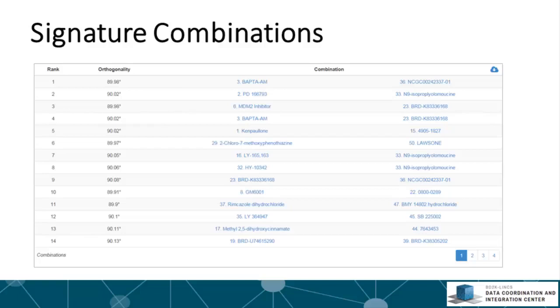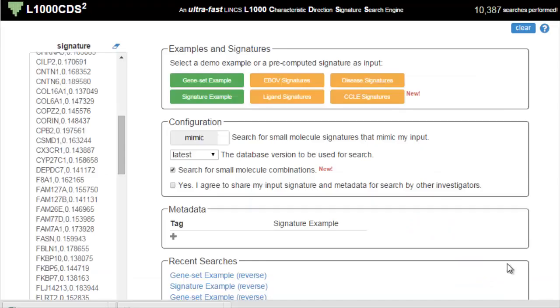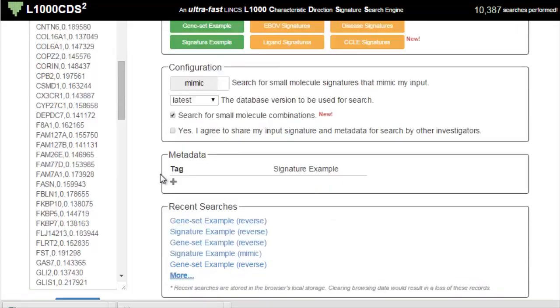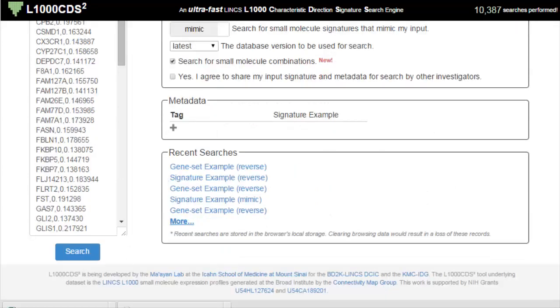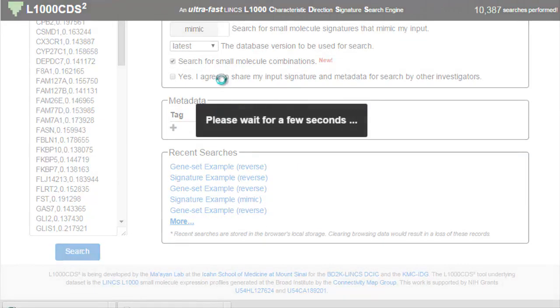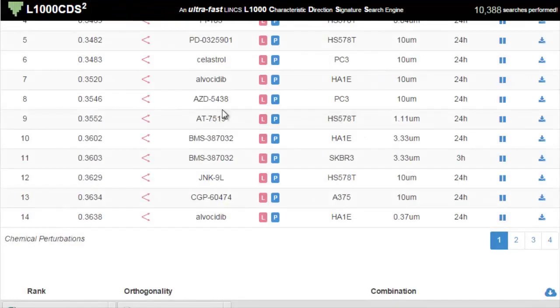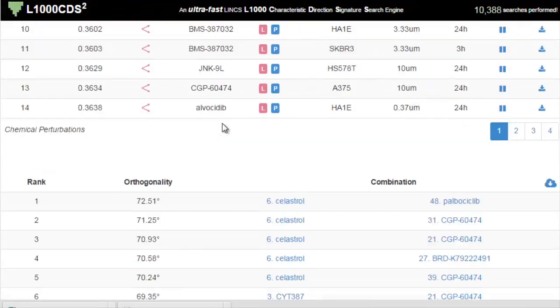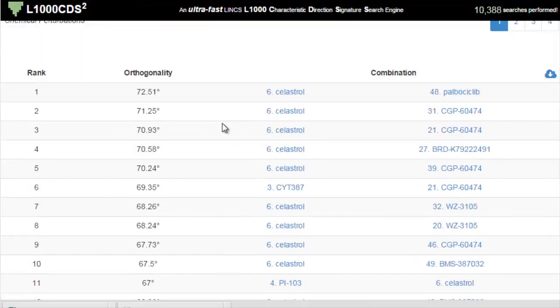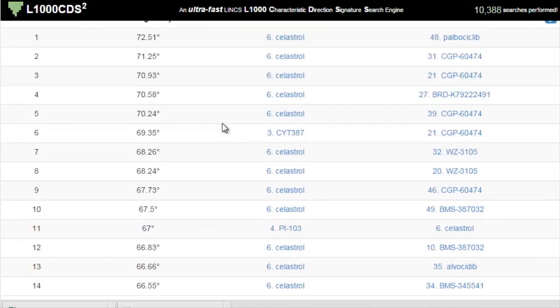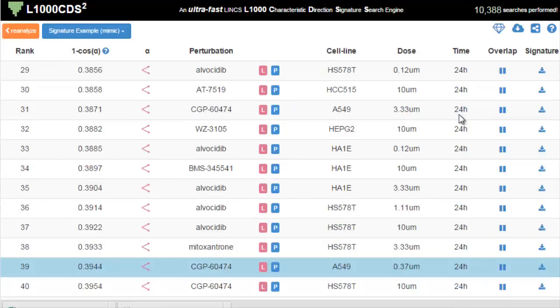The rationale for this is that two perturbations that are orthogonal may have an overall effect on two independent pathways, pushing the cells into the same direction. The rank is based on the synergy score. The number before each chemical perturbation in the combination column is the rank of that perturbation in the single signature results page. Clicking on the perturbation will highlight that perturbation in the single signature results table.